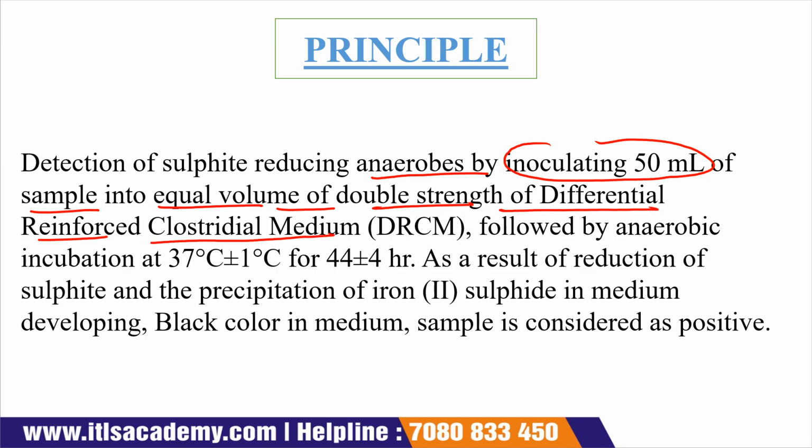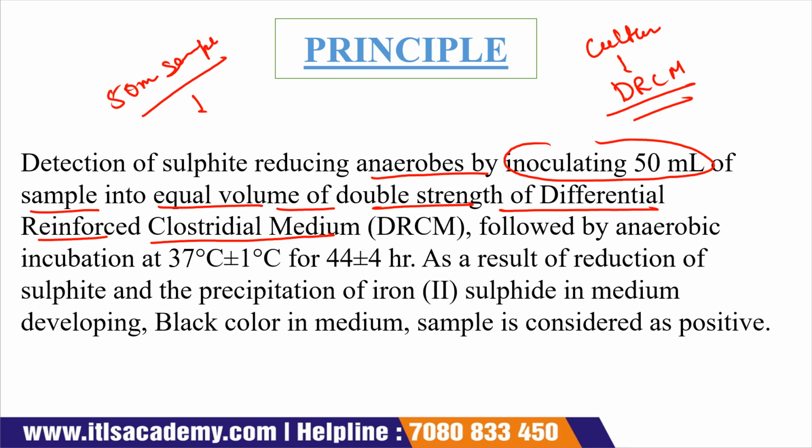Okay, here the culture media is DRCM. So for the detection of this Clostridia, we inoculate the 50 ml of sample into the equal volume of double strength differential reinforced Clostridium medium.